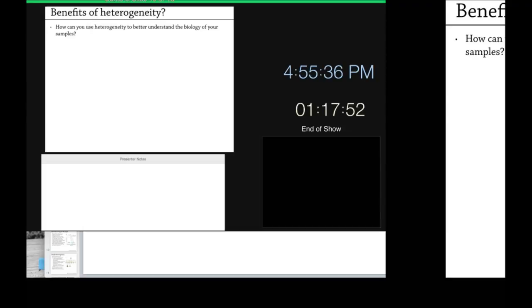But heterogeneity is sort of the center of this biological question that we were working on. So these proteins exist as homodimers, and there's one really strong dimerization interface that shows up in crystal structures and biochemical experiments. But we think that there are other interactions that aren't quite as strong, that we haven't been able to see biochemically or in crystallography.